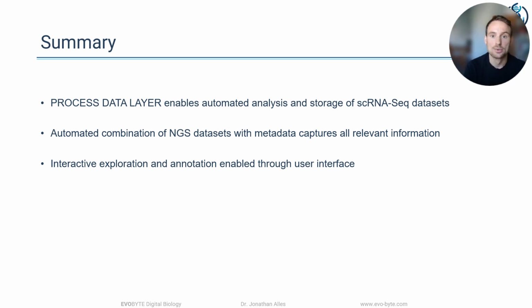We've seen how to design consecutive data analysis steps that are automatically triggered once new raw data arrive. So in this case, we first check that the FASTQ files are actually valid and have the right format. Then we trigger the automated analysis of the single-cell RNA-Seq raw data using a standard pipeline like the 10x Cell Ranger or any other pipeline that one would like to implement here.